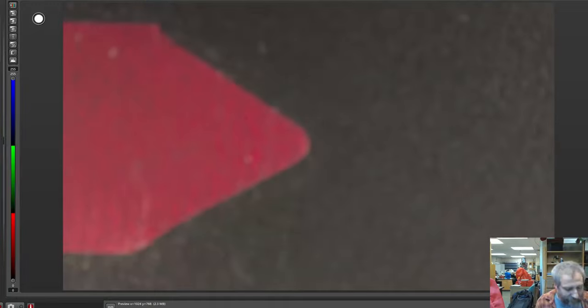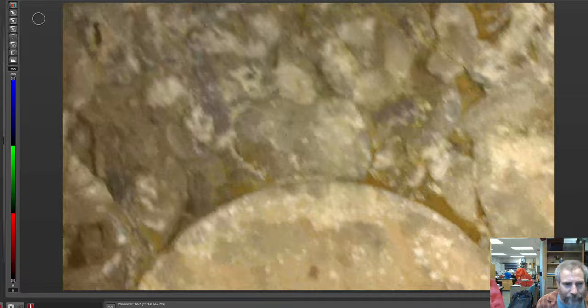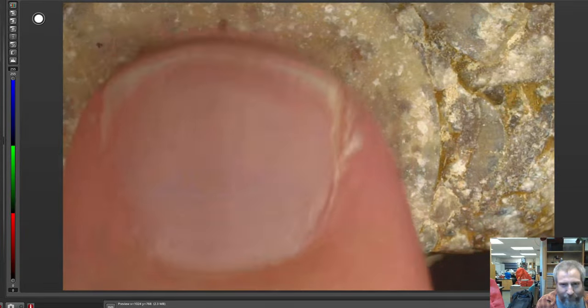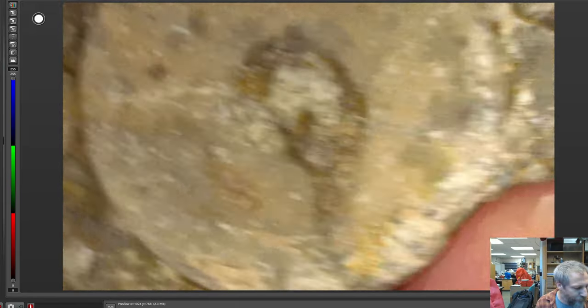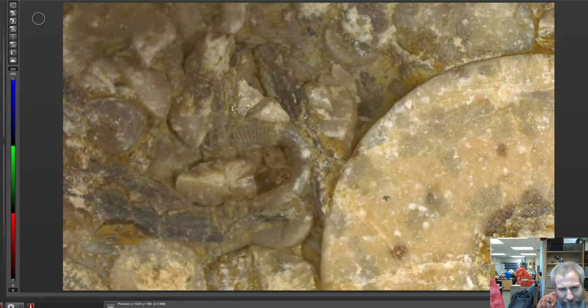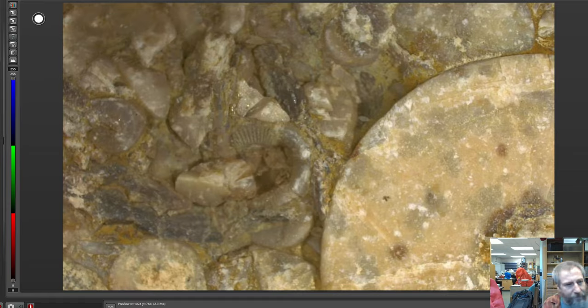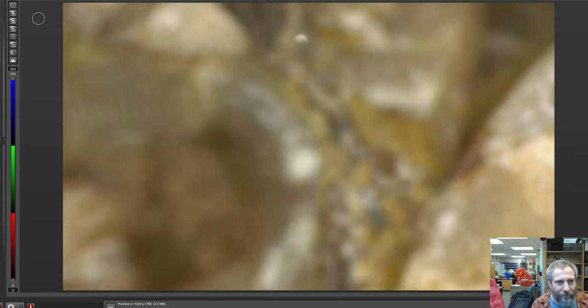Let's slap something else on here. I've just been staring at these. It's got some really beautiful crinoids in it, like this really big one. That's my finger for scale right there. That thing's as big as my whole hand. So it's a pretty big crinoid. And actually, let's see if I can get it to focus. Not used to things this big on the microscope. We're super zoomed out as far as my microscope is concerned. I'm at the farthest distance I could be.